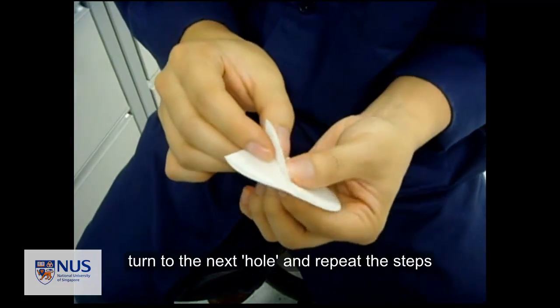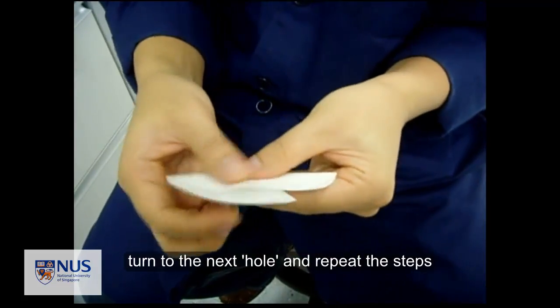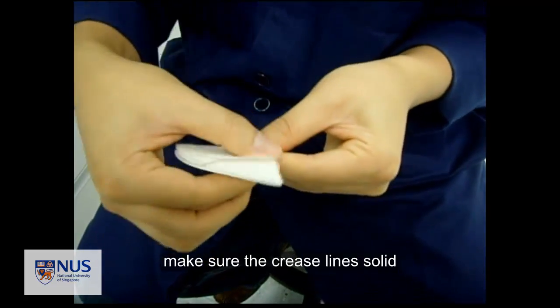Next, you turn to the next fold, open it, enlarge the cavity, divide into halves, and press hard to create the crease lines.